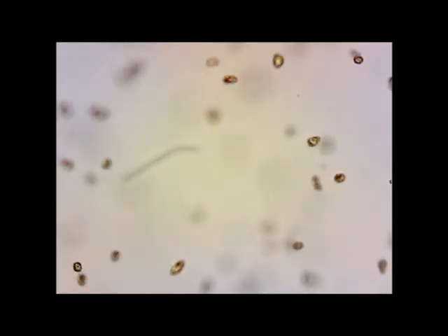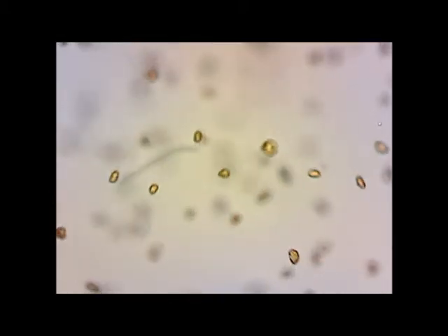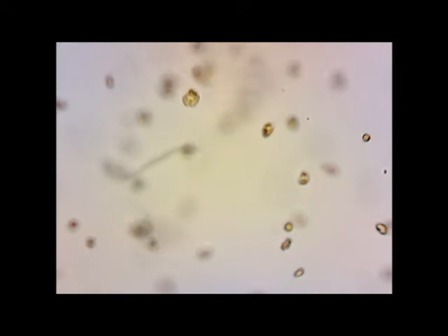Heterosigma also has two flagella that come from the side of the cell. That's what pushes them forward, but we can't really see those in live samples as they're moving all the time.